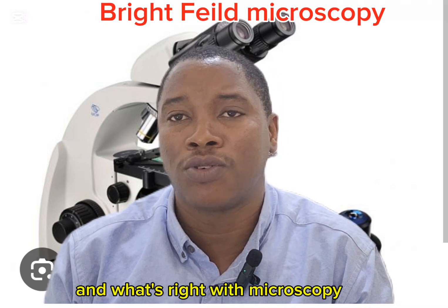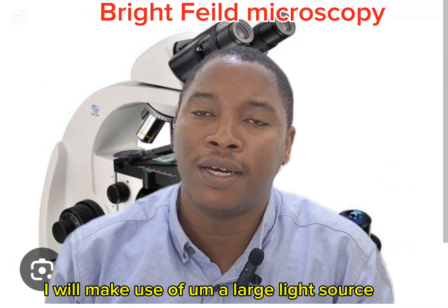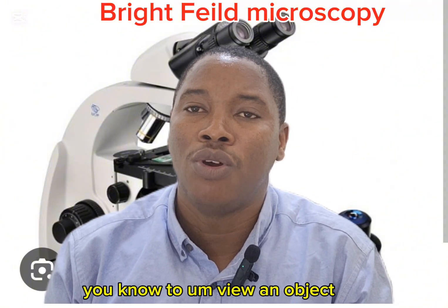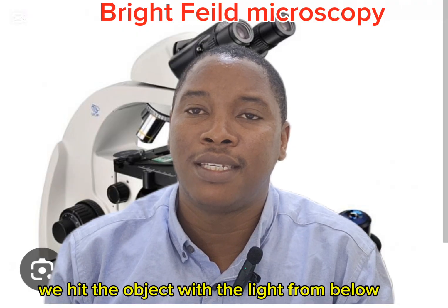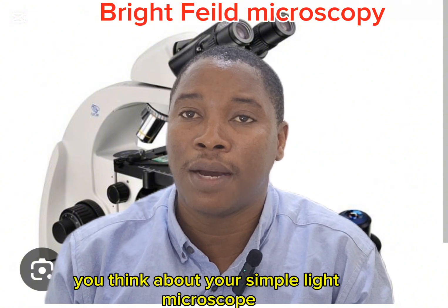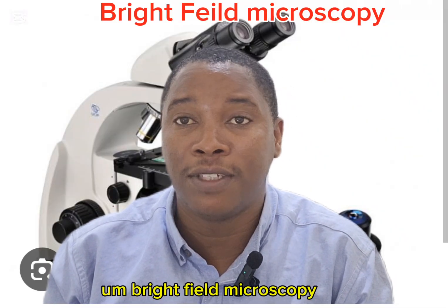And what's bright field microscopy? This is a type of microscopy where we make use of the microscope and a large light source. Sometimes we use LED light or a halogen source of light to view an object. Usually we hit the object with the light from below and then we view from above. To simply understand this, think about your simple light microscope. A simple light microscope makes use of bright field microscopy.